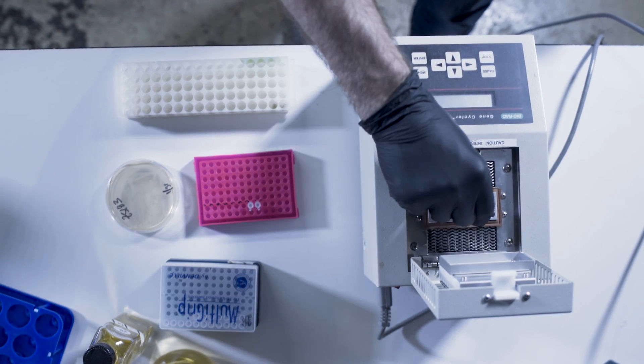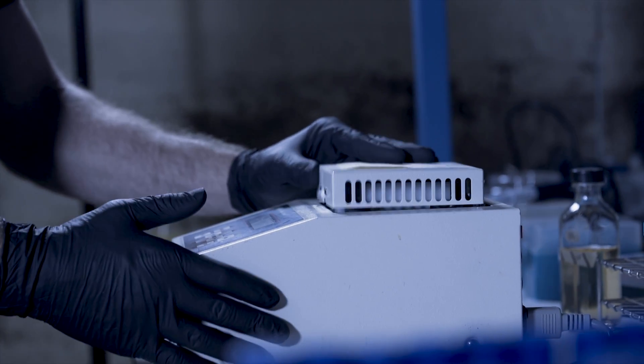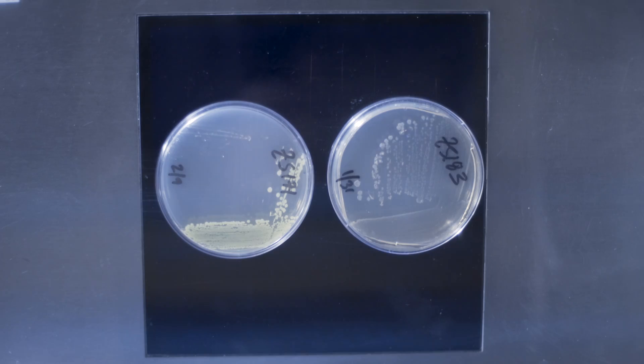Once you've verified that the bacteria successfully integrated the fluorescence gene, you're done. Turn off the lights, turn on some UV and check it out.